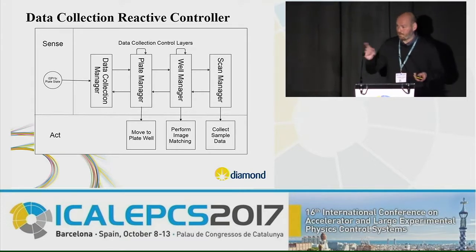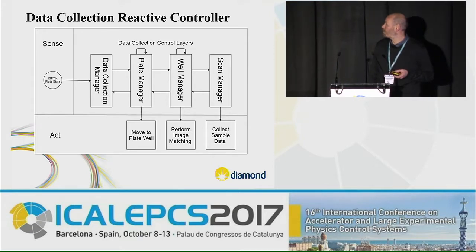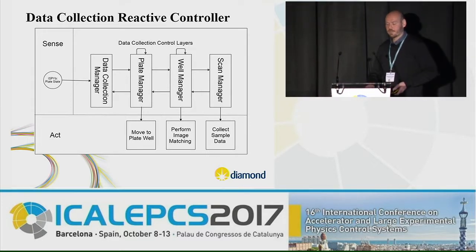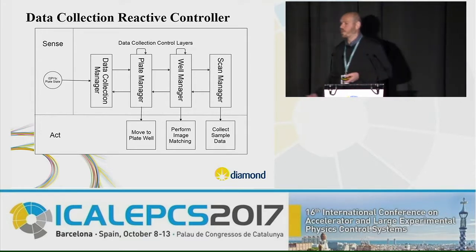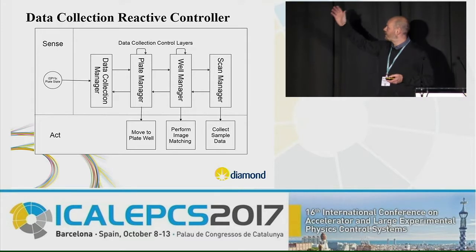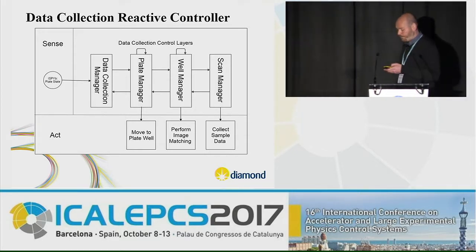Very fortunately, we have the mapping project. You may have seen posters around this already at Diamond; it's been deployed across beamlines there. And we use that to do the synchronization. So all we do is present the hardware with our experiment parameters, press go, and monitor the actual progress of this. And of course, if there are any problems, then we deal with that as well. So eventually, we process the plate, and then we set the state that the plate has been shot, and that's the cue for sample handling to remove the plate from the beamline.